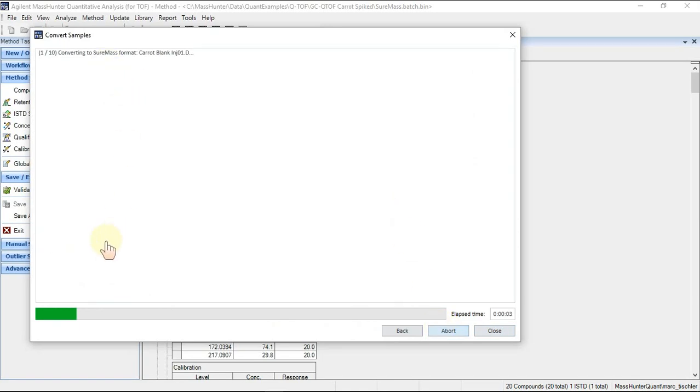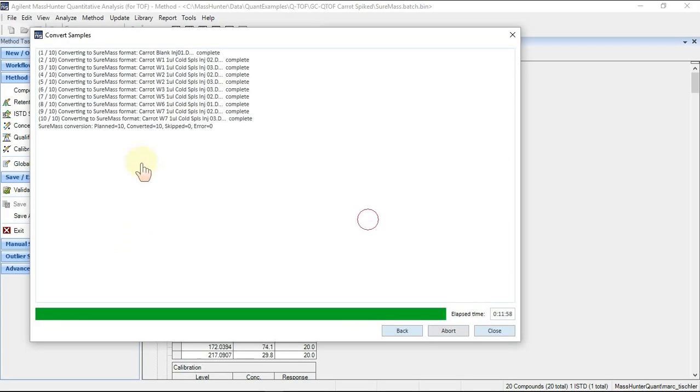You'll see when it's done, it'll present you with a successful list. Now, as said, with the raw profile data, this is going to take a while to finish, and we expect you to automate this at the end of acquisition. So here we have the finished results.